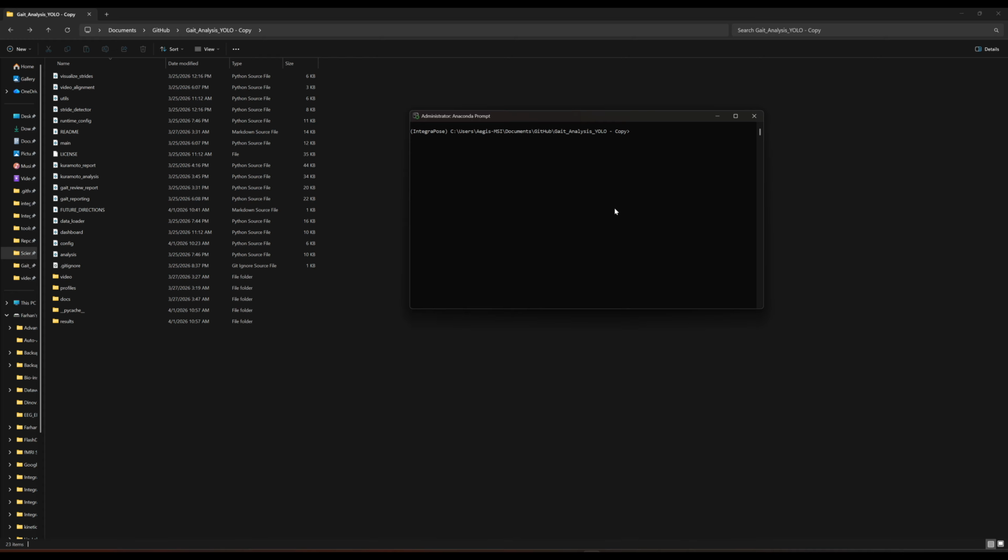Yeah, okay. So a few other things. I'm going to go ahead and run YOLO-Pose on the video that I have.